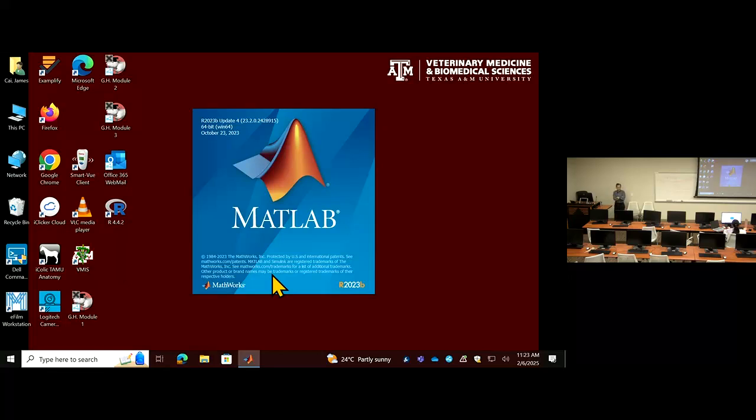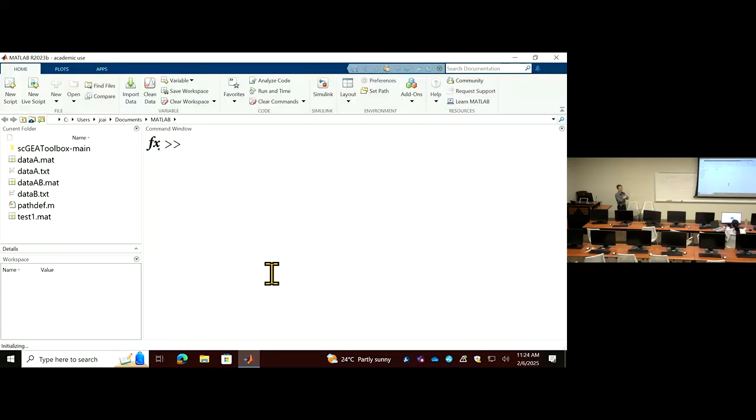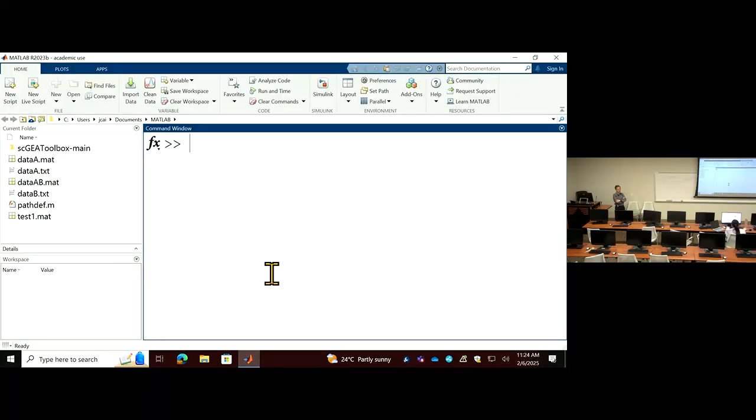So now I'm going to use a smaller example data set to illustrate the main steps you can use to trim this to a high quality set of data, rather than play with the raw data. If you have only one sample at such huge scale, then when you merge another one, it will definitely sooner or later blow up your PC, unless you have access to clusters. And by the way, MATLAB should be able to run on clusters as well, but you may not have such a nice interface. You may rely on the command lines to achieve some of the goals.